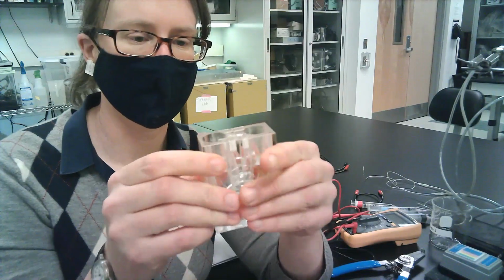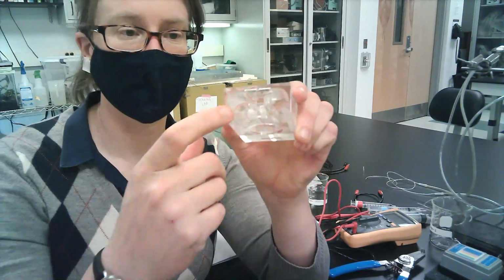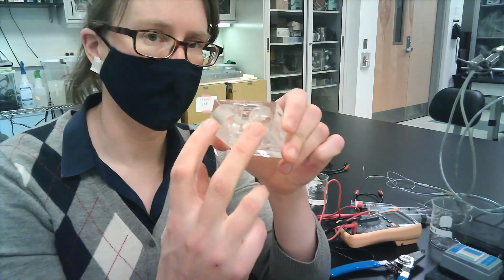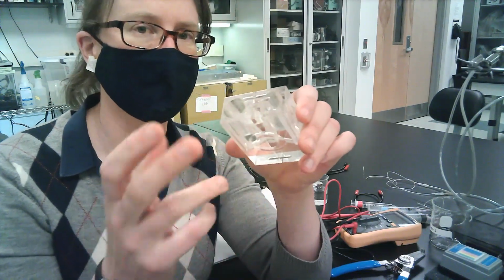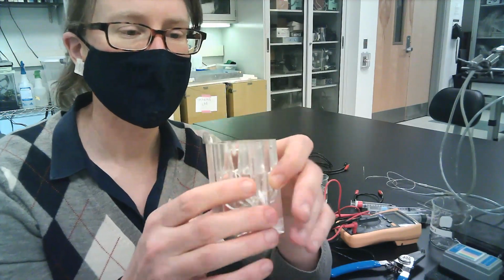Then everything will fit back together. And then what we'll do after that is there's two chambers here, and each of these will initially fill up with a saline solution, just frog ringer solution. So that contains a mixture of salts, and then it also has some glucose as an ATP source.